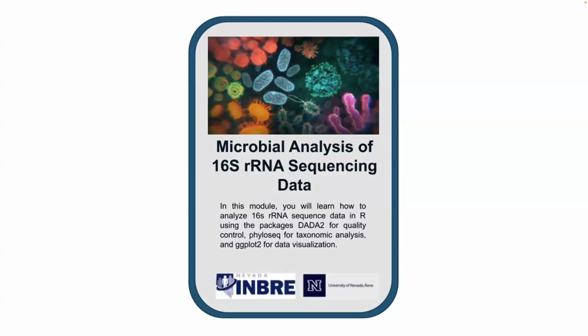Welcome to our microbiome analysis training module. In this cloud-based module, we'll take you through the process of analyzing microbiome sequencing data, from raw data to meaningful insights. Whether you're new to microbiome bioinformatics or looking to refine your workflow, this training will provide you with the essential skills needed to work with microbiome data.